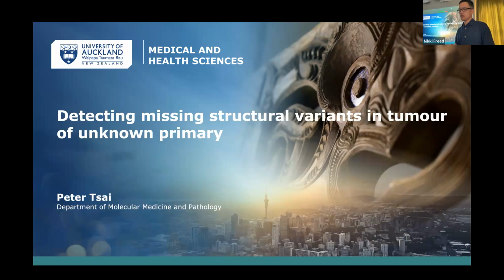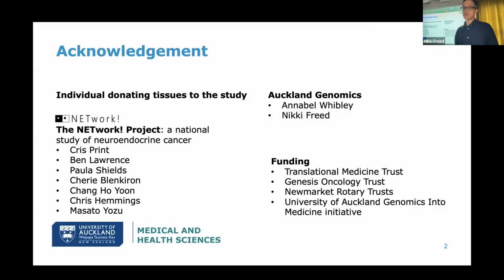Today, I'd like to share a bit about how we are using long reads in the cancer space in terms of detecting structural variants. So this is something that we couldn't do very well back in the days with short reads. So I like to start with acknowledgement first.